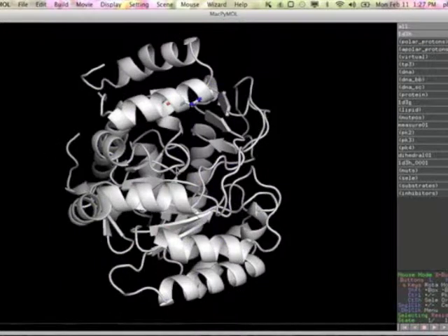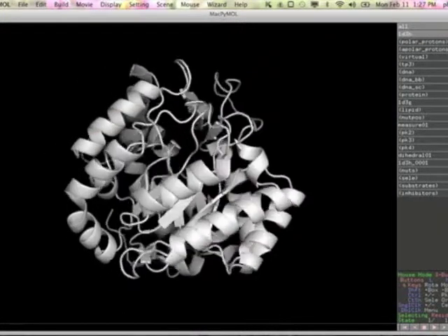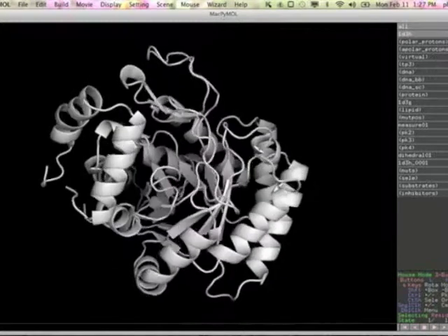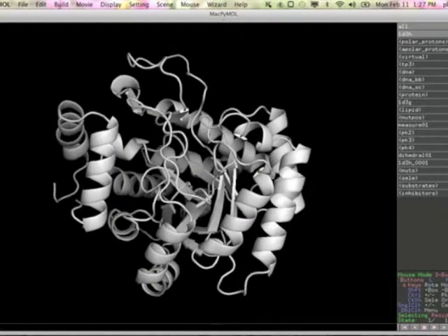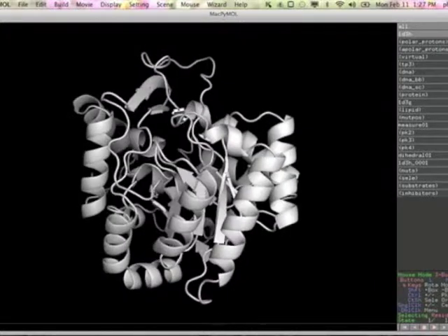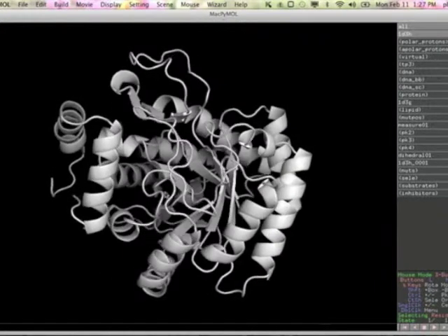And so here's one. This is now just showing the path of the backbone of the protein. So you guys probably know that a protein is a polymer, a linear polymer, composed of amino acids strung one to the next. And this is showing just the path of the backbone of that chain. So it's sort of like a long necklace that wraps around in space.